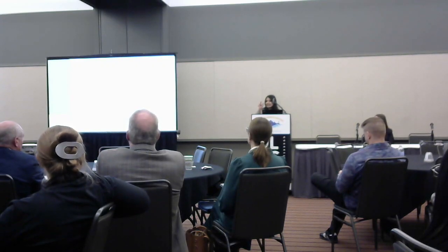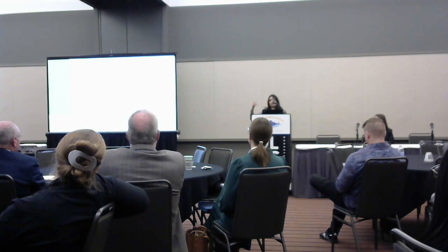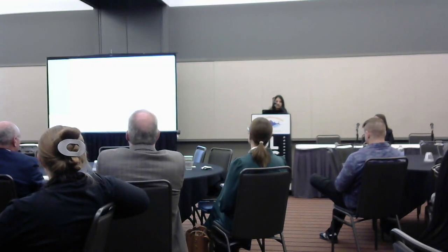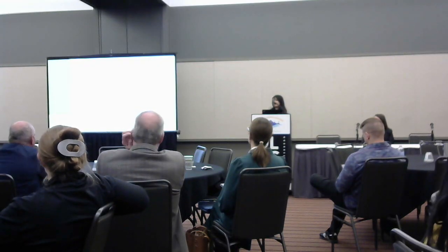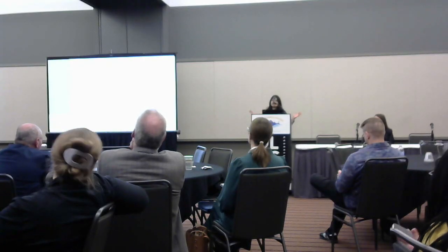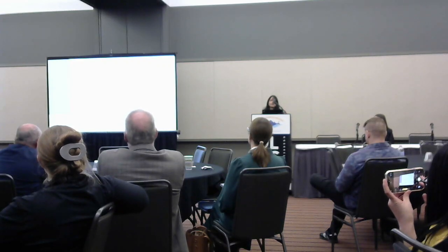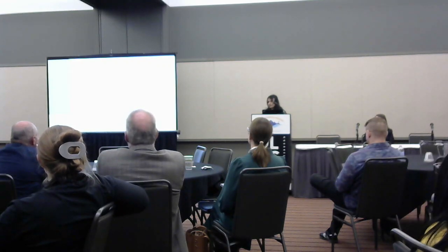So if you think about each image, it's not that big, but just the volume of images that were being collected, that's like several thousands of images, and they had a repetitive pipeline to follow for each and individual image. That included masking, applying a filter, segmentation, and quantification of multiple parameters. If they were to do it on an individual workstation, I don't know how long this could have taken, but this was ideal for a containerized batch analysis on our HPC system.